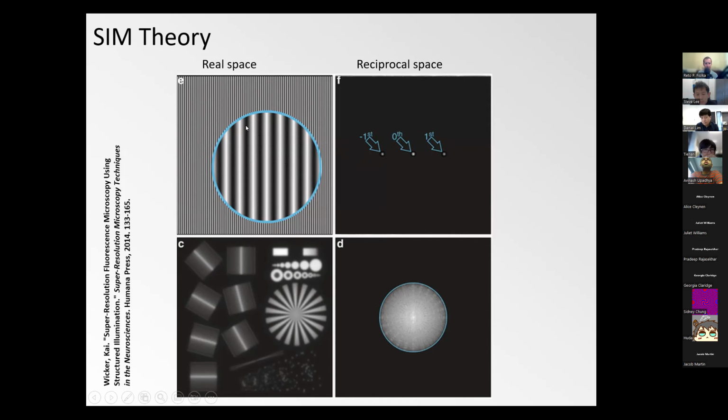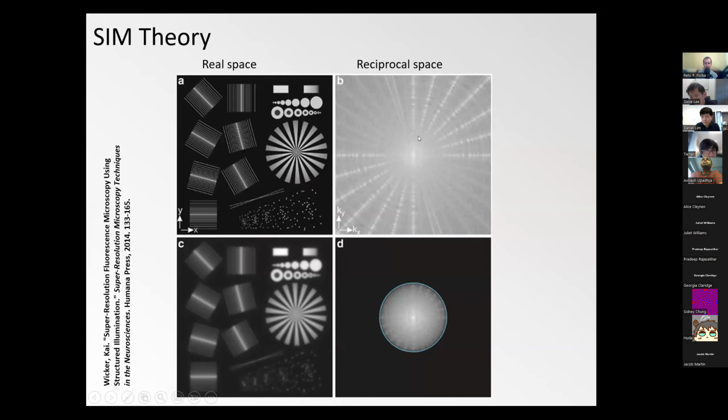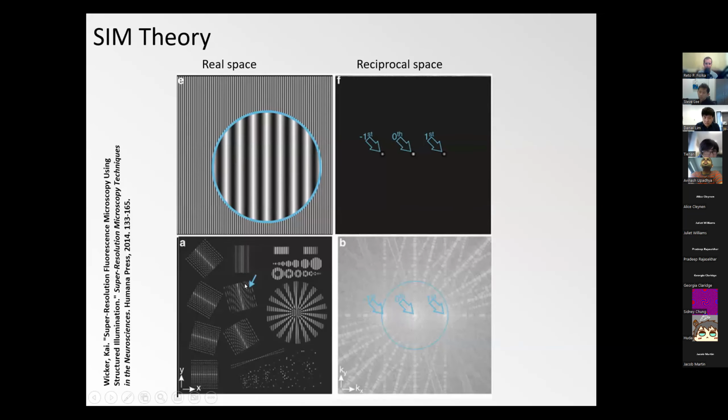If we illuminate the sample with that pattern, then the emission function actually gets modified. You start to see some of these Moire fringes, or patterning of the sample. Here you see some of the coarser structures that we have seen in the example before. Interestingly, if you take the Fourier transform, you can see it's a bit of a mixture of information. Before, the Fourier transform had these radial spokes coming out of the origin. Now that in real space it has been multiplied by this sine pattern, you can see there are some spokes that have been displaced, and also this central dot has been displaced.